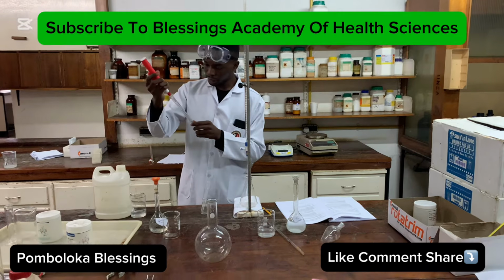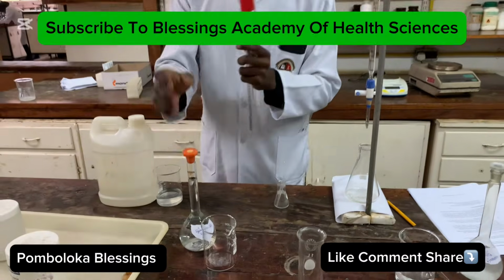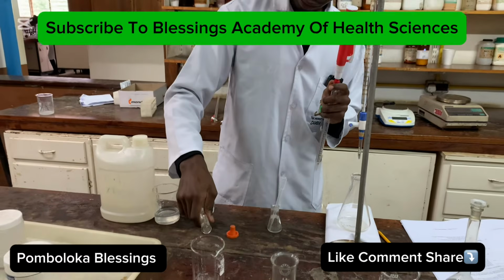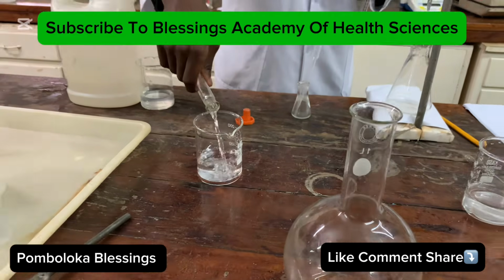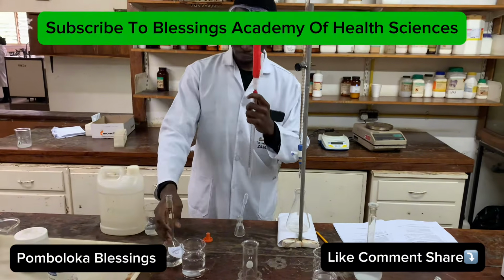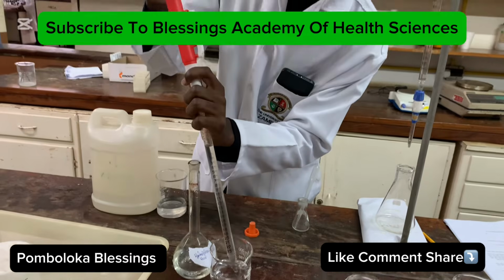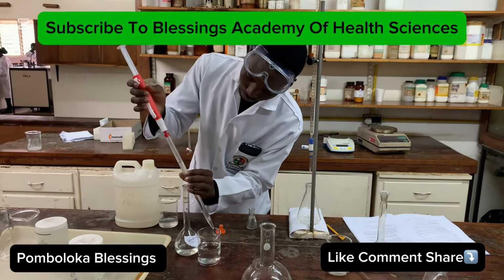Of the hydrochloric acid. So remember our HCl is in here. This is our HCl there. We're getting 25.